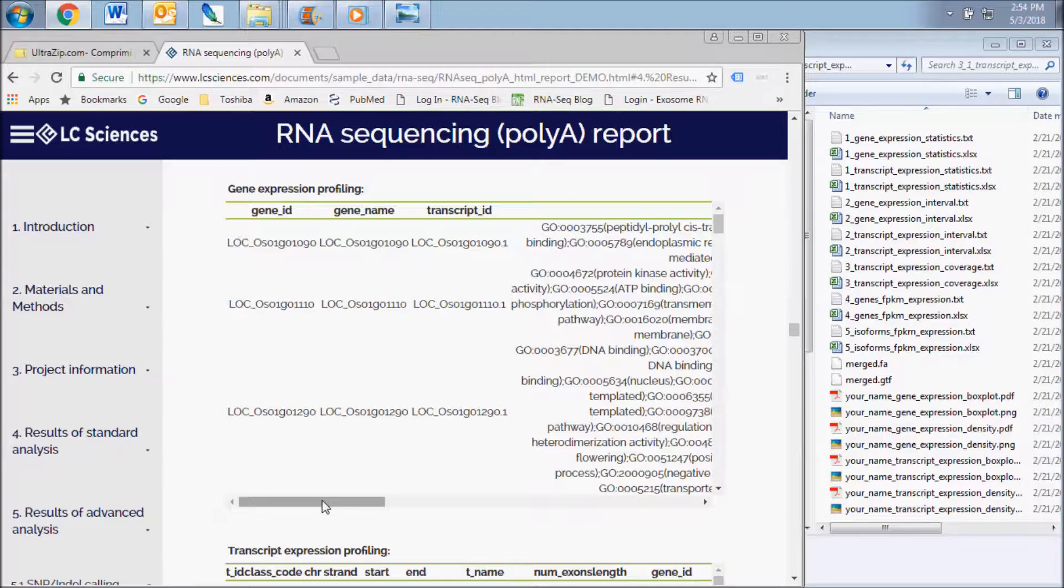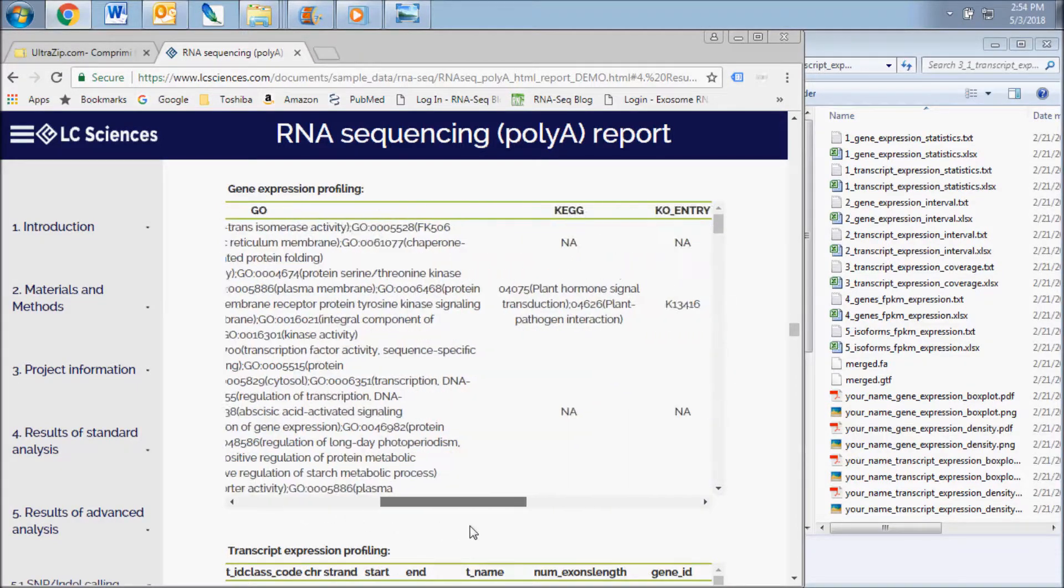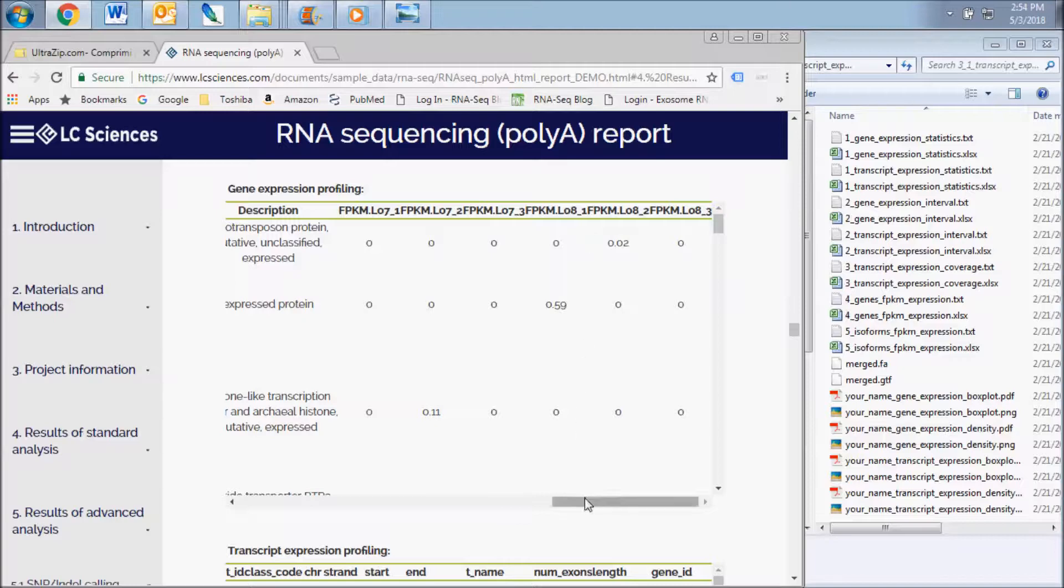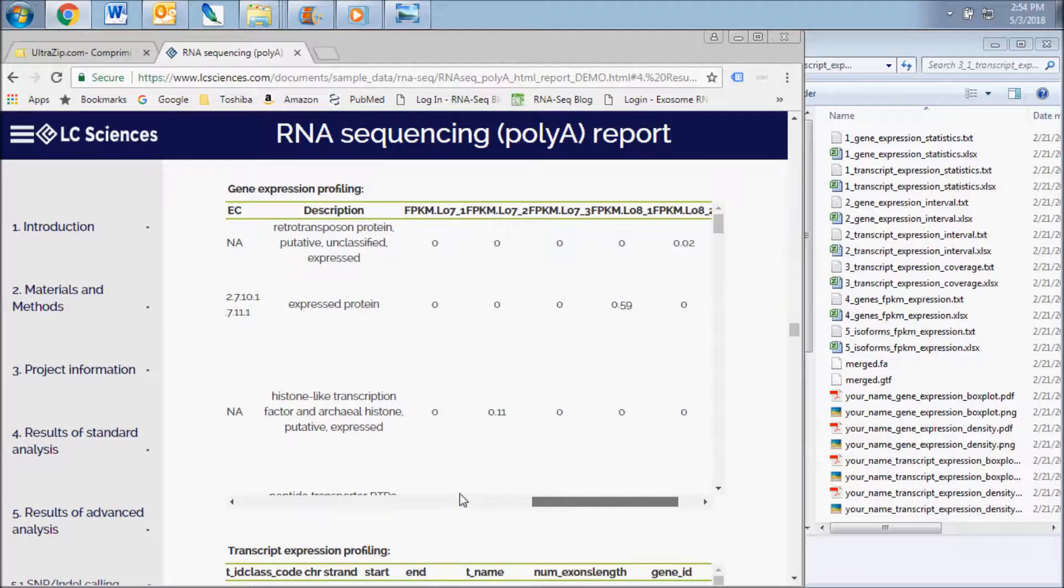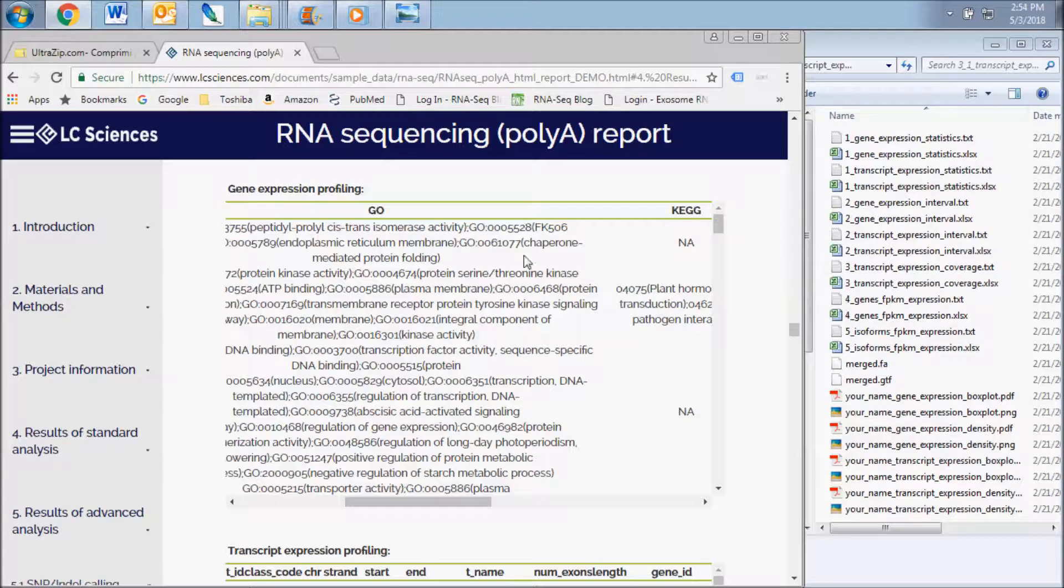Additional details for each gene and transcript are presented here as well, such as GO and KEGG entries. Remember this chart represents an abbreviated data set. Refer to the Excel sheet in the transcript expression folder to see the data for all genes sequenced.